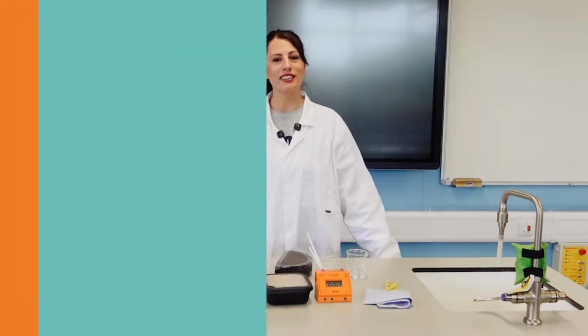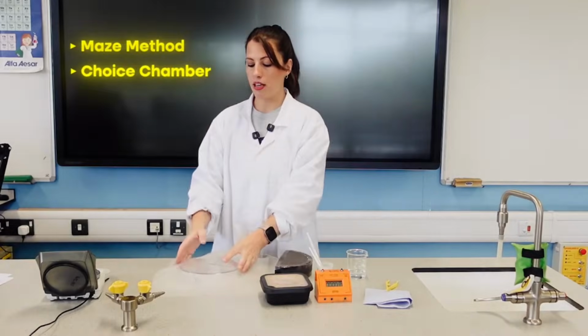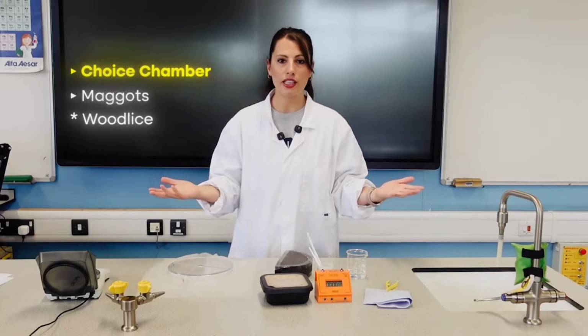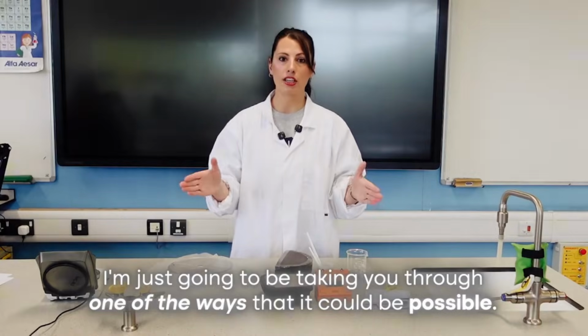There are lots of different options of how you could do this required practical. You can actually do it as a maze or a choice chamber. I'm going to be doing it as a choice chamber today, and I'm going to be using maggots. You could also use woodlice for this. Even within doing it as a choice chamber, there are different ways that you can do it. I'm just going to be talking you through one of the ways that it could be possible.